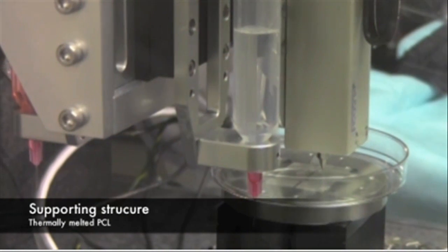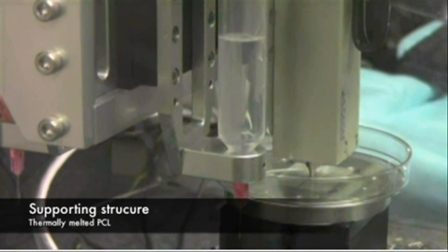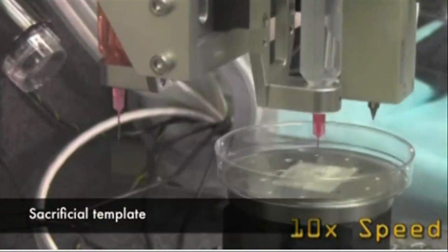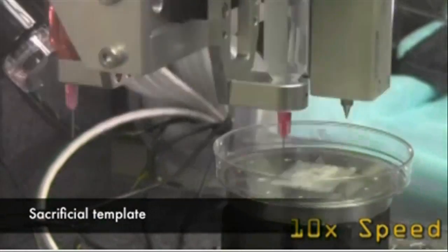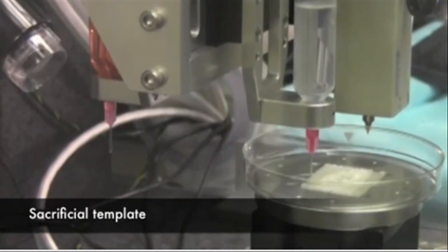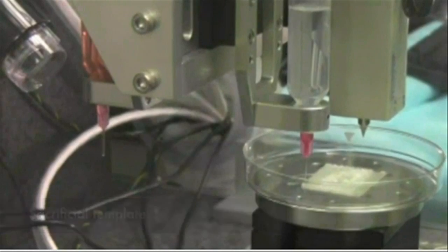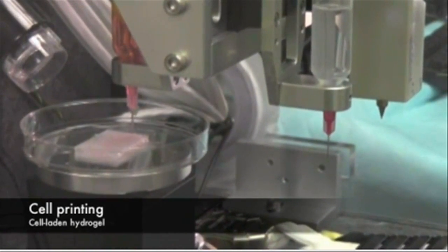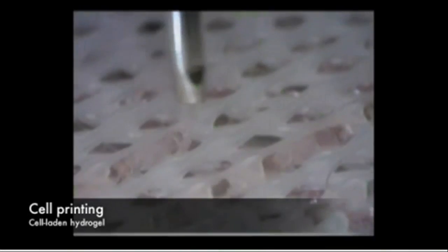A major challenge of tissue engineering is ensuring that implanted structures live long enough to integrate with the body. The Wake Forest Baptist scientists addressed this in two ways. They optimized the water-based ink that holds the cells so that it promotes cell health and growth, and they printed a lattice of micro-channels throughout the structures.